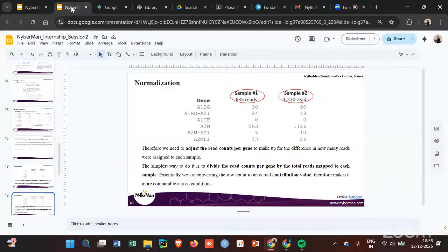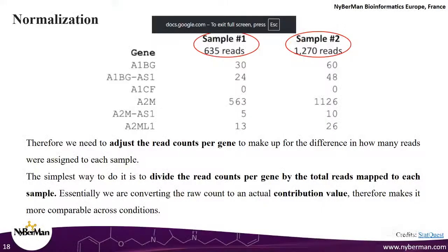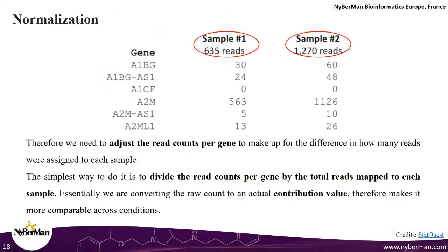We don't have a lot of time. I'll quickly start wrapping up. So after we are done with our normalization, now these samples are comparable against each other. Now it comes to the analysis part. Till now, all of the stuff that we have been doing is trying to prepare the data so that we can actually perform the statistical analysis. Now we try actually performing some analysis.